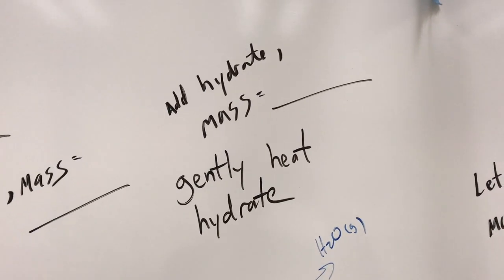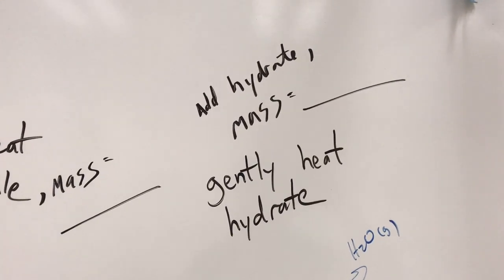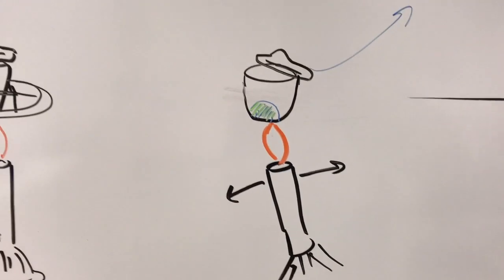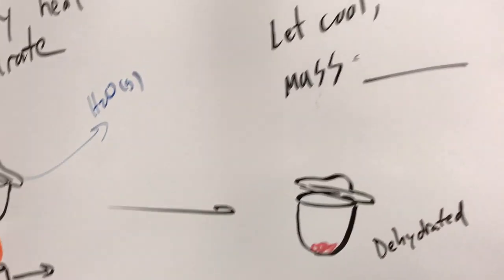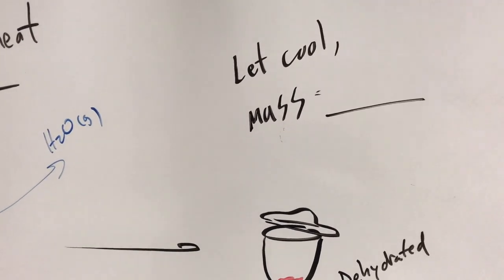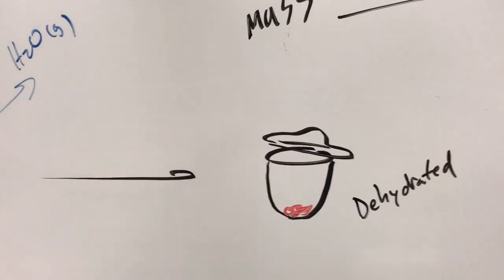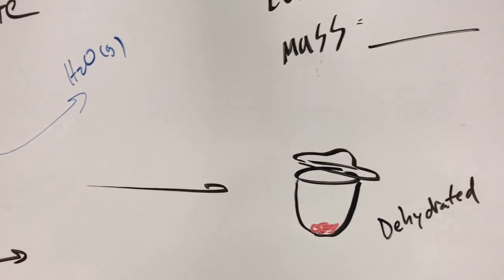Once it's cool, we're going to add a certain mass of hydrate to the crucible. We're going to record the total mass, and then we're going to gently heat it with a small flame, moving the burner back and forth, and we're looking for a color change. Once the hydrate has completely changed color, we're going to let it cool, and record its mass again. Now the mass indicates the mass of the crucible with the dehydrated sample. So any mass change that has occurred was attributed to water vapor evaporating out.